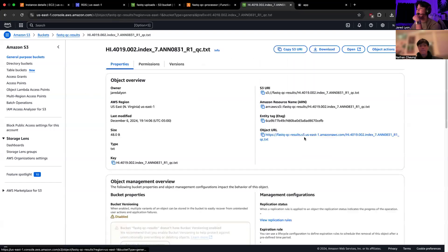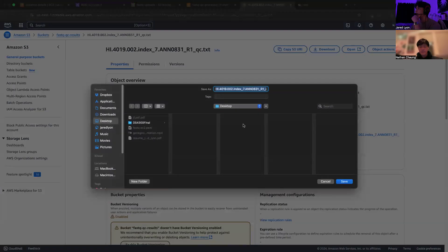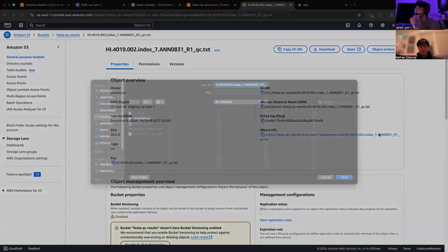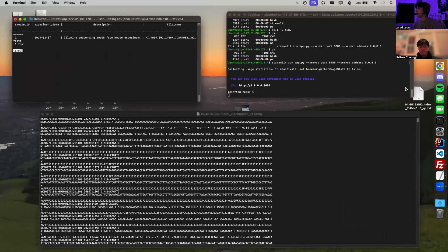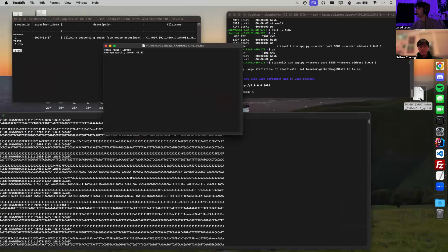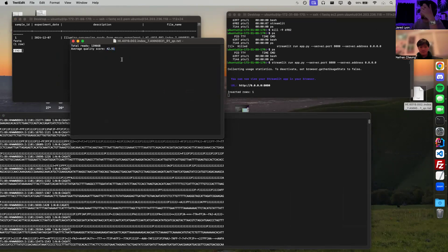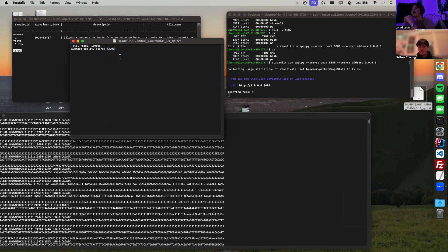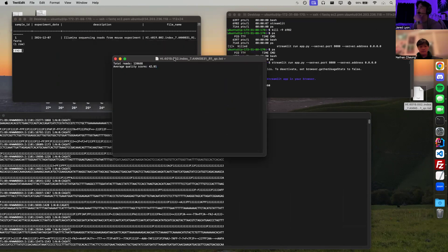We can go ahead and download the file. And then we will open that up, see what we got. And we got a quality score of 42, which means very high quality. I believe that is 0.001% error rate in the quality. And then we have a total read of 139,668 reads in the file.